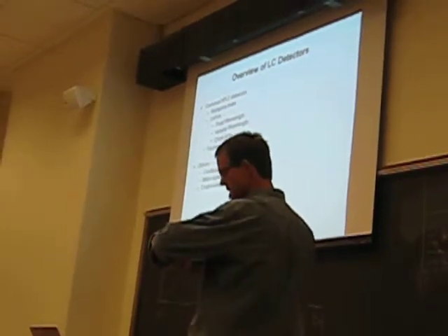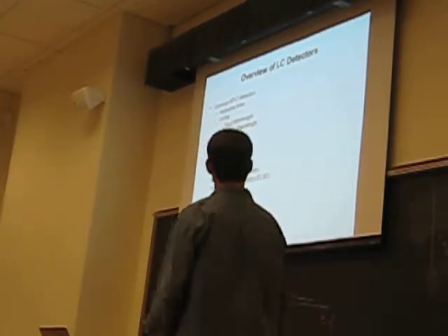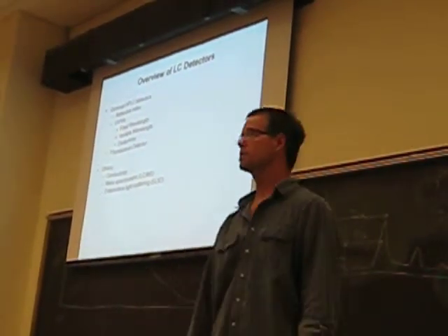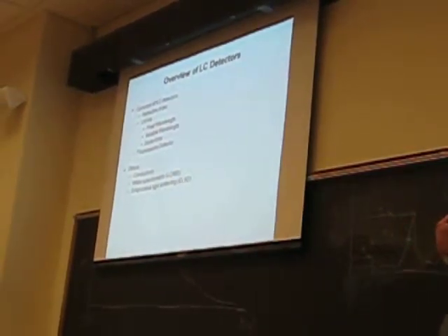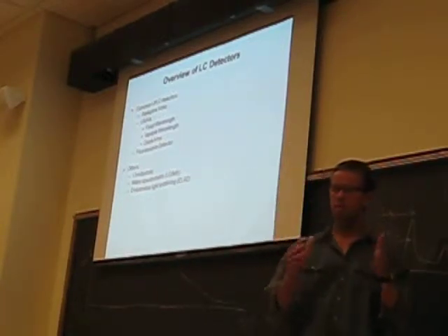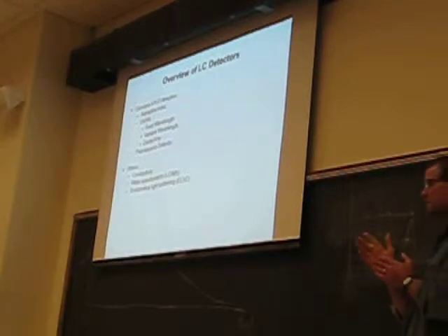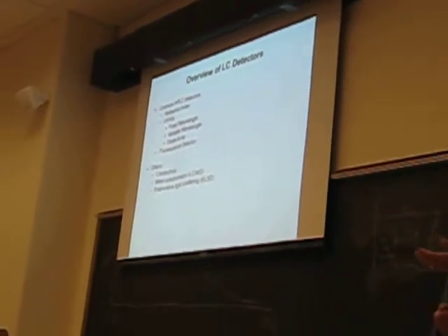I want to talk a few minutes about detectors beyond what you've experienced for the chromatograph that you're using in class. Because I made a point of saying before that for liquid chromatography, HPLC is probably by far the most commonly used. And in all chromatographic systems, the point, like you said earlier, is to separate analytes in the sample, right? And of course, we have to be able to detect what those analytes are, but in the vast majority of cases, in chromatographic systems, the detectors are just what we would characterize as bulk detectors, just like in yours.